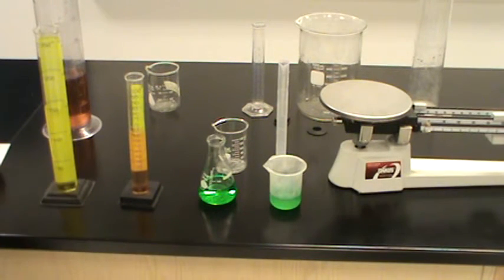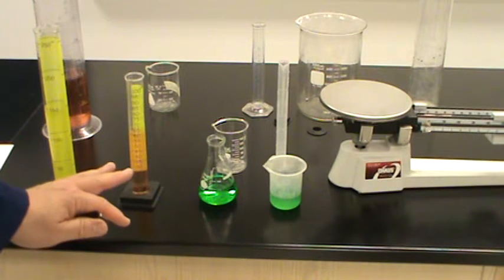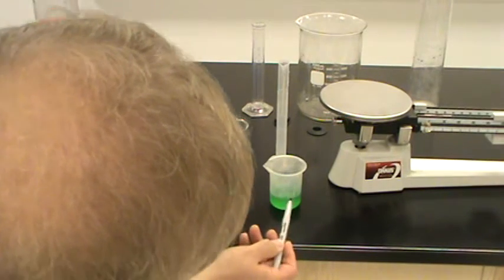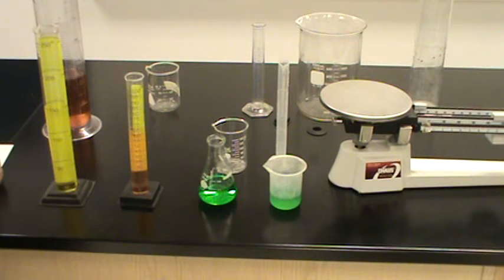One of the students the other day asked what was in these. Was it something dangerous? I wanted to make up something and say, yes, this is the mandrulipus acid. Very dangerous. But it's just colored water. So please don't get worried. It's just colored water so you can see it better in the container. And this one comes up to the 40 milliliter mark.